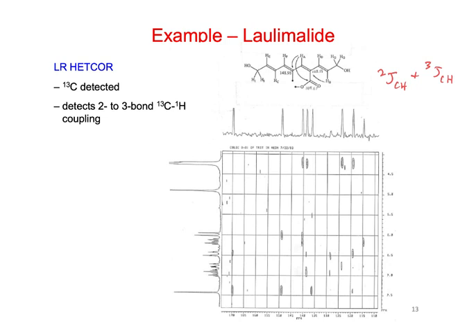So if we start with this HA, and we go across this way, we can see coupling to here, which I think is to the ester, right? We can see couplings here and here, which might be the two quaternary carbons, and then I think we actually even see something further down here. But you can just piece together these quaternary positions in this way.